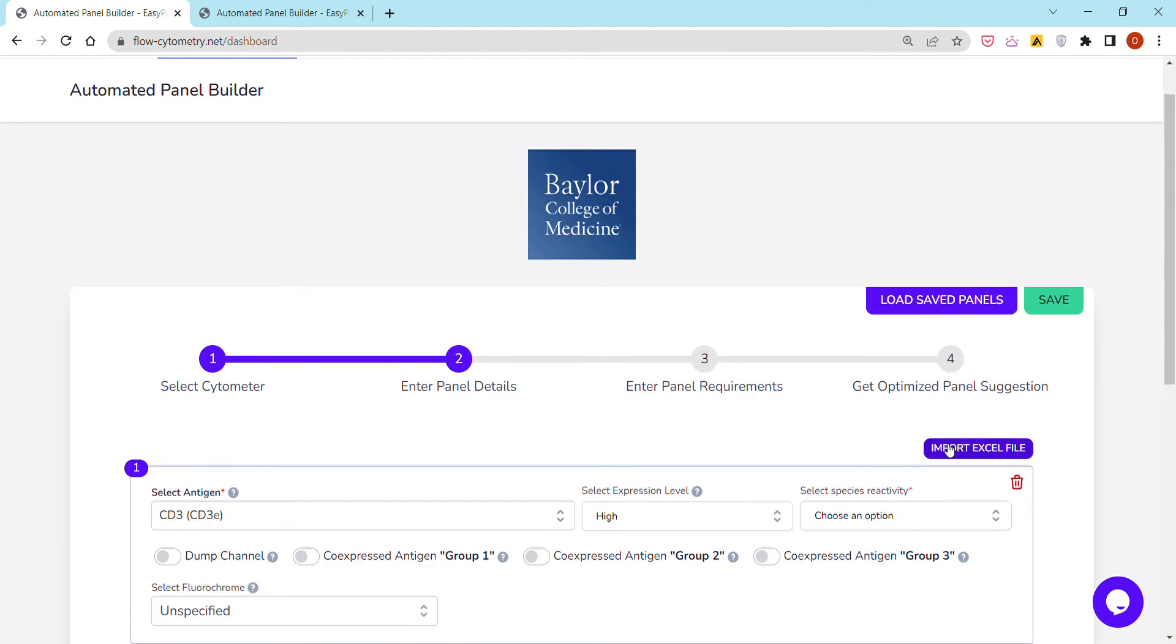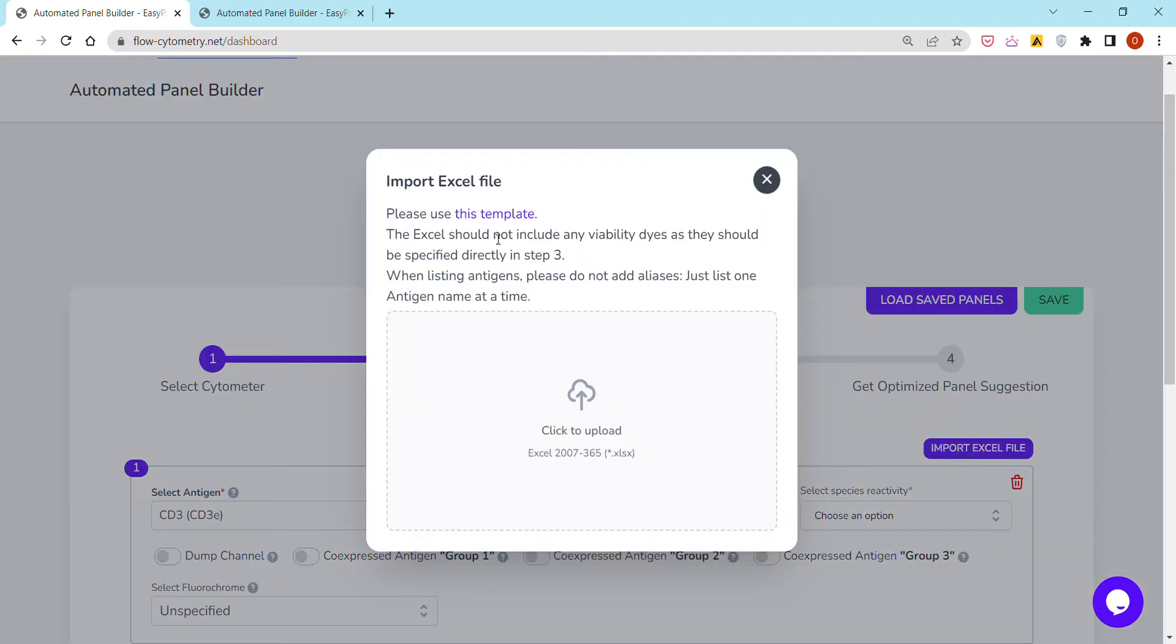Alternatively, I can choose to import them directly and automatically using an Excel or CSV template that just looks like this.